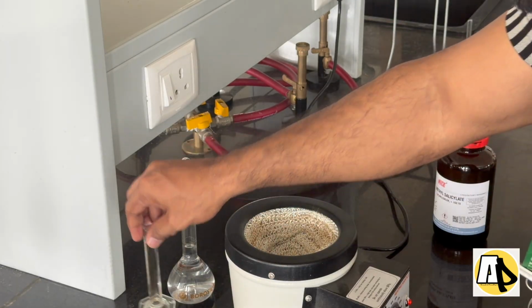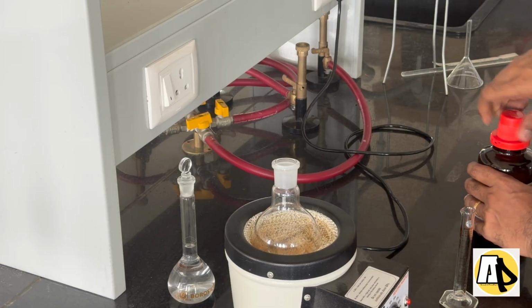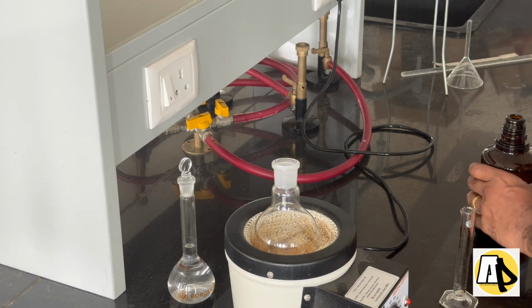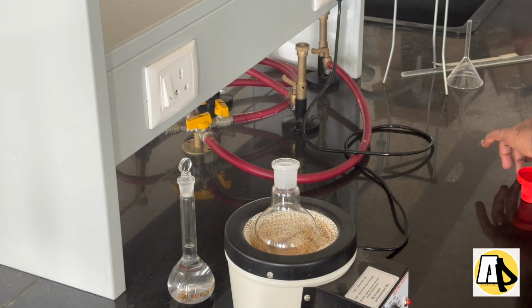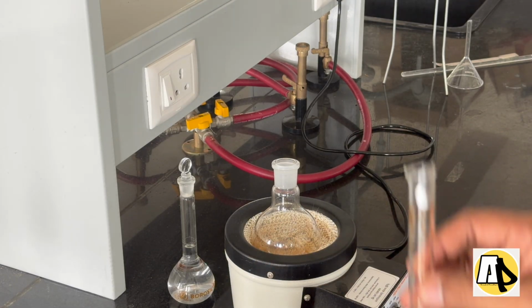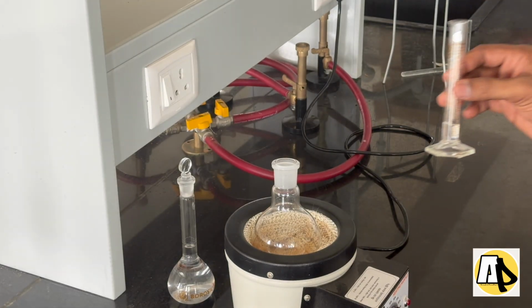So as per procedure, we need to measure methyl salicylate. So you all know it is 10 ml of methyl salicylate. No, 2 ml of methyl salicylate. So we have got 2 ml of methyl salicylate.